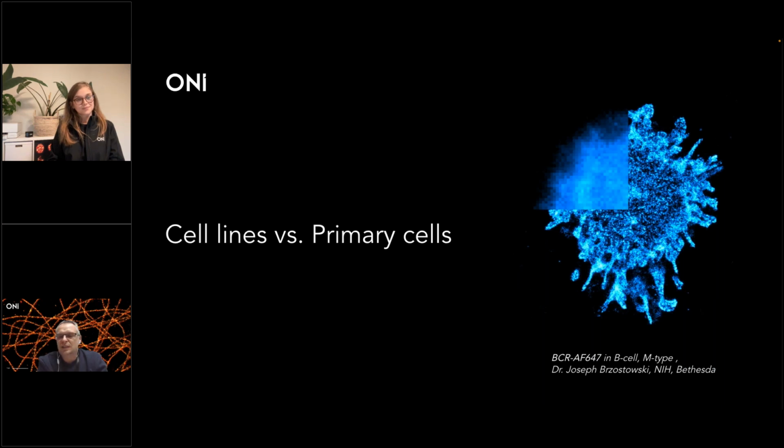Or if you are more interested in the inside of the cells and want to get deeper, like a nucleus permeabilization, then you might actually need to use Triton. That's harsher. It will open your pores inside the membrane, so that can affect at some point the reorganization of your receptors on the surface of the cell membrane. Yeah, indeed. So a little bit of optimization is always necessary.